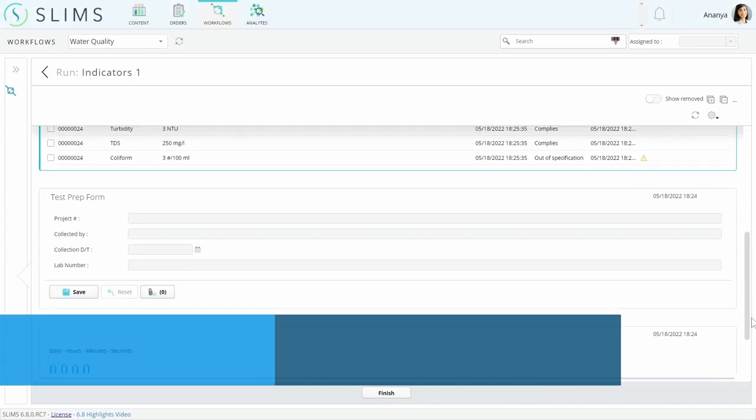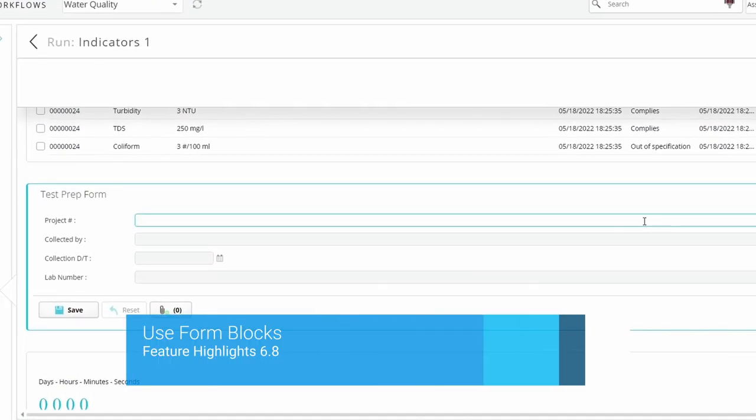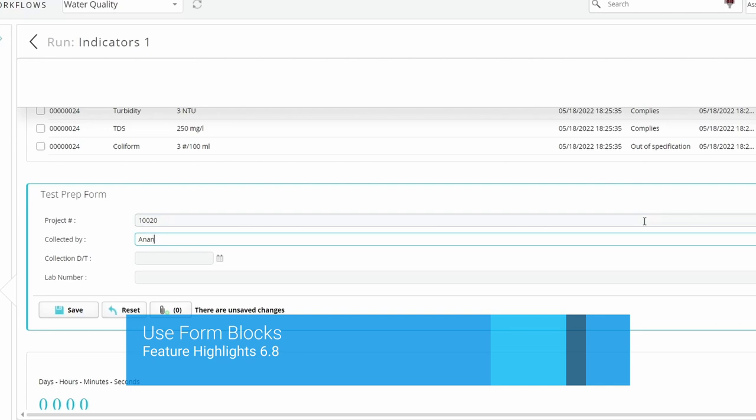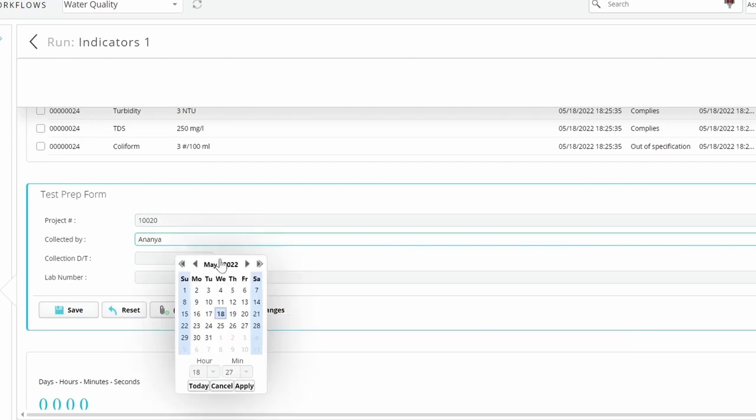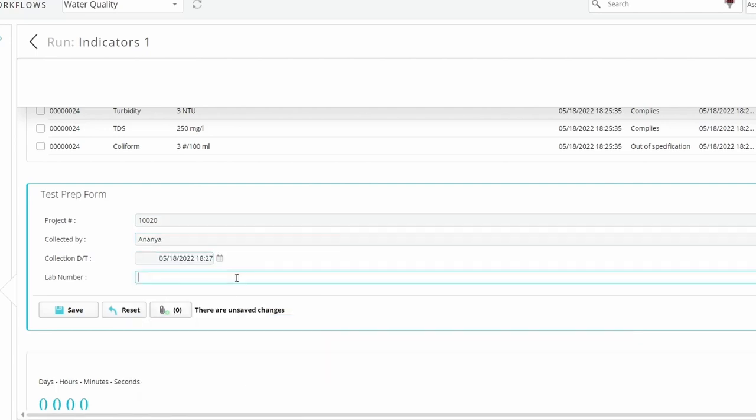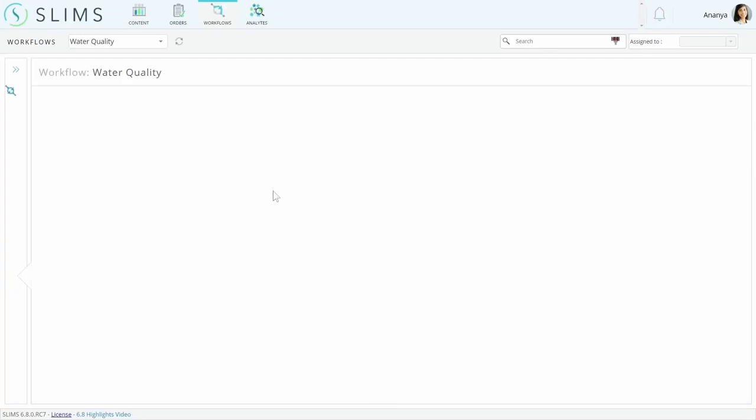Besides result blocks, a form block can now be used in simplified protocols. Any custom fields you create on the protocol run step table will show up on the form. You can restrict the fields to particular protocol run steps though, so they'll only show up on particular forms.